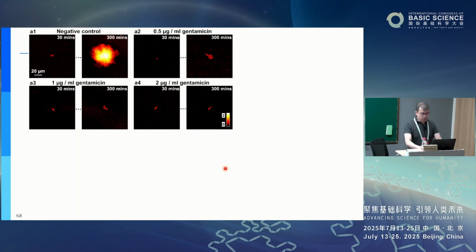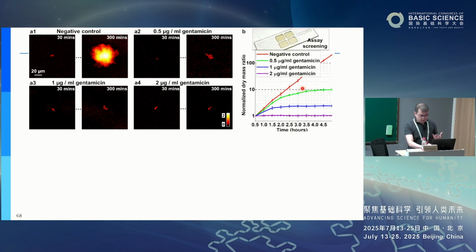One application here is we try to perform antibiotic drug testing. The idea is that if a patient gets some infection, you need to determine which drug is most effective against the infection of the patient. What we can do is monitor the growth of the bacterial colonies over time, and from there we can determine the so-called MIC, minimum inhibitory concentration. That is the drug concentration we are going to give to the patient.